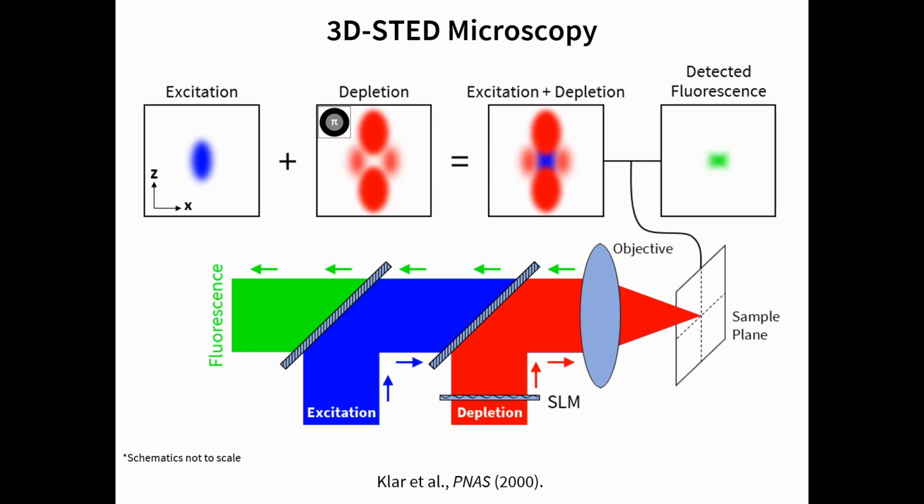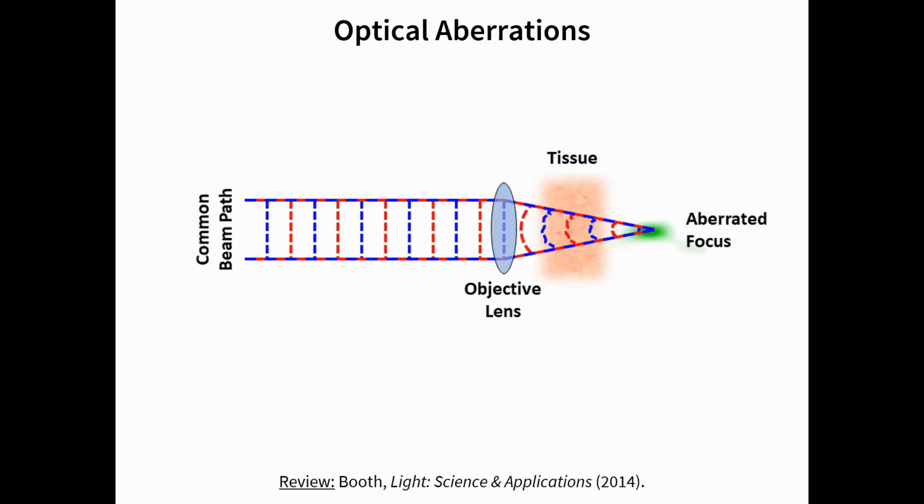Unfortunately, the same cannot be said for the 3D STED donut that is generated using this top hat phase pattern here, which is actually extra sensitive to aberrations. And basically, the way that this focus shape responds to aberrations is that you get depletion light leaking into what is supposed to be a perfect zero intensity in the center. And the effect of that, of course, is that you now have a depletion focus that switches fluorescence off everywhere, rather than just confining it to a subdiffraction limited size. And this effect applies even when you're combining this Z depletion donut with the XY depletion donut for optimal depletion in all three dimensions. So because of that, optical aberrations can pose a major challenge when doing deep tissue STED imaging, or even just deep tissue imaging in general.